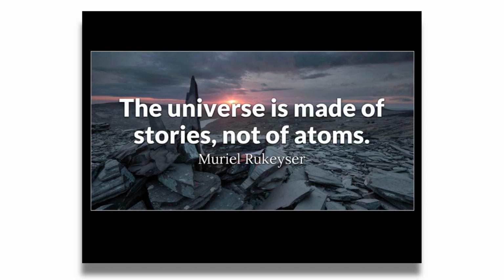So what I hope to share with you today in the next half of my talk is a couple of stories that we've learned along the way when studying eicosanoids and looking at their utility as biomarkers. When preparing this talk, I came across a quote that said the universe is made up of stories, not of atoms. As chemists, we believe, of course, that the universe is made up of atoms. But when thinking about how to quantify compounds, it's useful to tell a couple of stories to indicate the types of issues that we need to consider when developing a mass spectrometry method to measure these molecules.